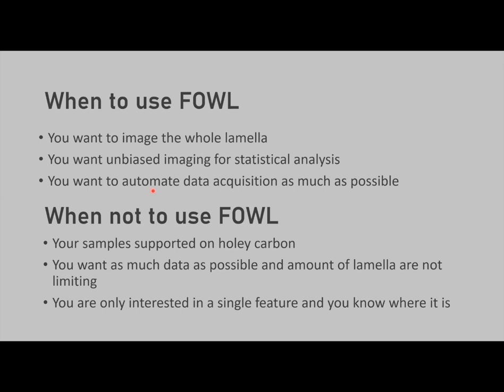afterwards. Some reasons why you might not want to do this are, for example, if your samples are supported by Holey Carbon, in which case you would just spend a lot of time imaging carbon. That's probably not efficient. You might also not want to do that if you just want as much data as possible, because you're not using your whole detector and you're collecting some areas twice. You might actually get more data if you take separate exposures where you cover the whole camera. But of course, that's only the case if you have an unlimited supply of lamella.